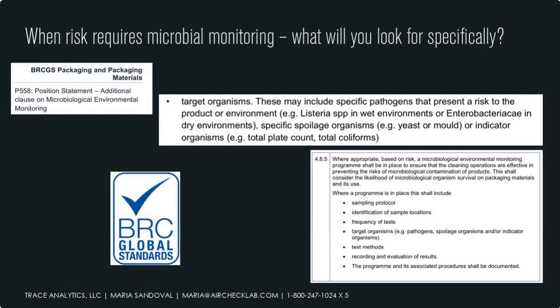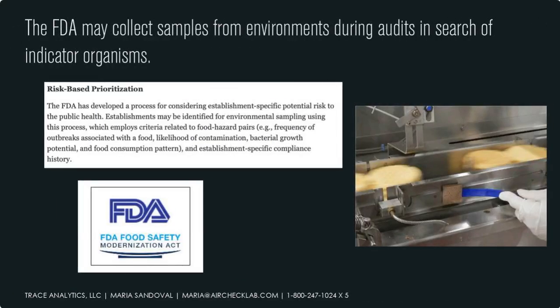Sampling protocols, you need to identify your locations. You need to identify how frequently you're testing. What organism do you care about? What type of test method are you going to use? How are you going to be recording it? How are you going to be evaluating those records? And all of that needs to be kept inside of a controlled document system. So it's really important that you start asking those questions.